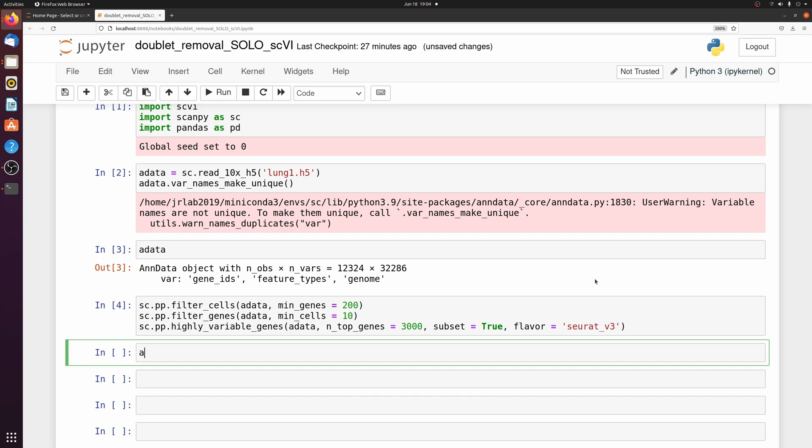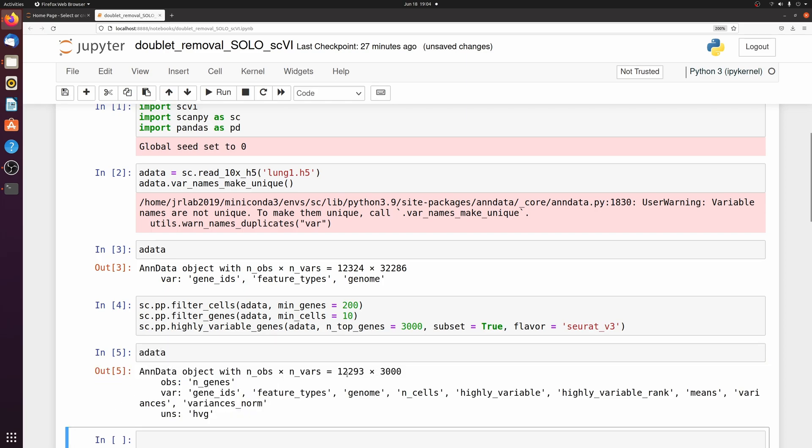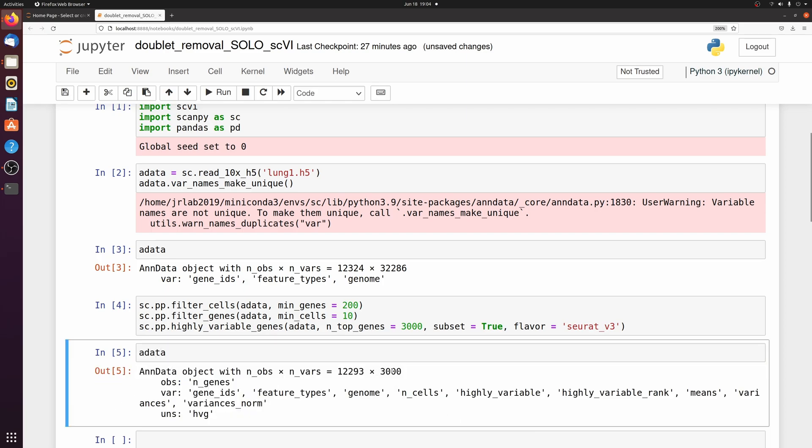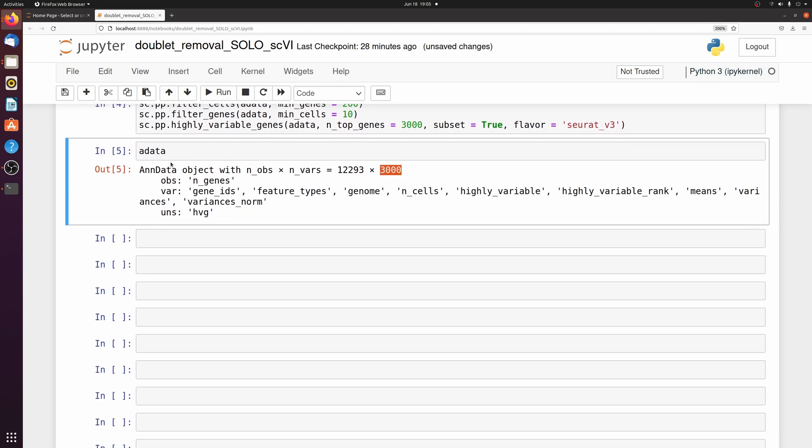So if we look at our adata object we have 12,000 cells and 3,000 highly variable genes. So we're going to set up the scvi model and train it just using default settings.